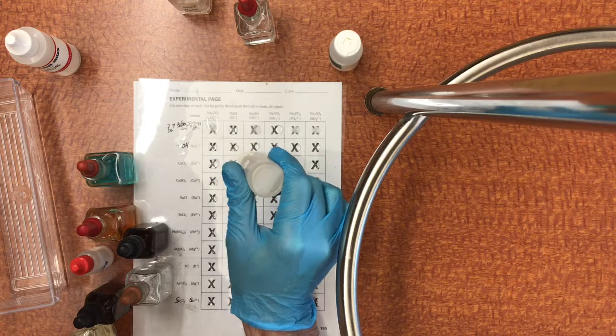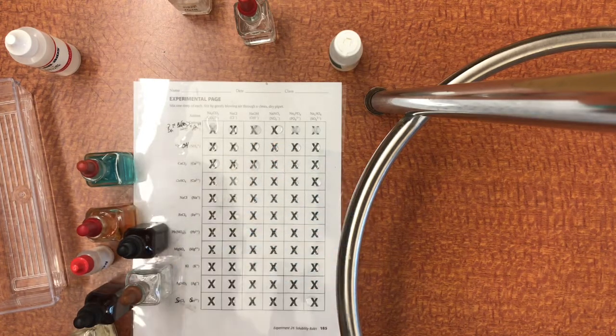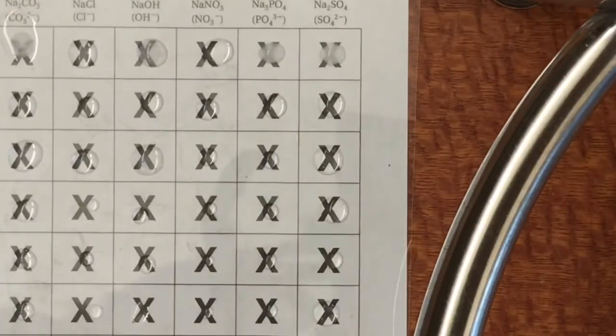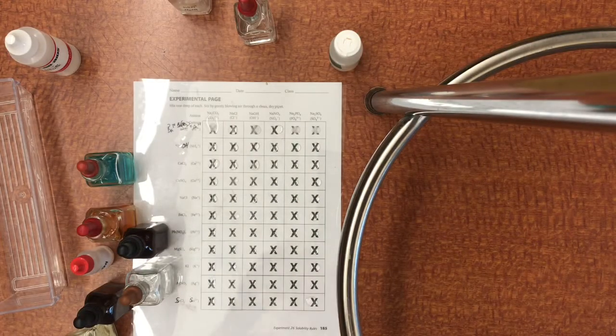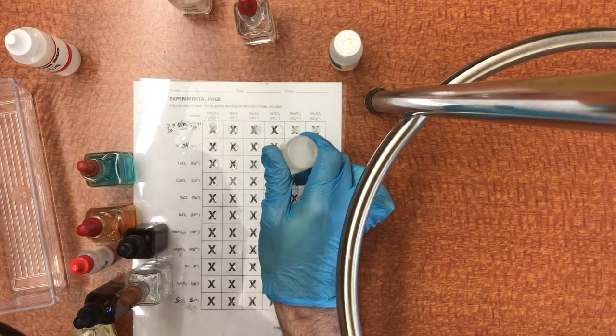Calcium chloride with chlorine will have no reaction. With a hydroxide, I am seeing a reaction. You might not be able to see it from where you are, but there is a reaction here in the calcium chloride. It's just a little tiny bit cloudy. I'm not sure if I can zoom in there. You can see a little bit of cloudiness, not too much. It is a swirl though.